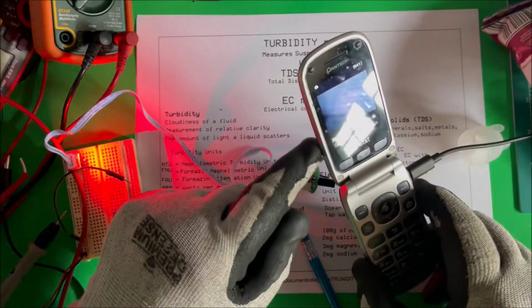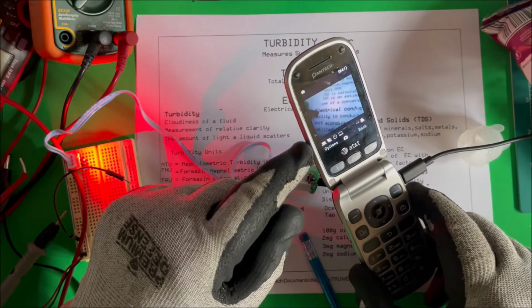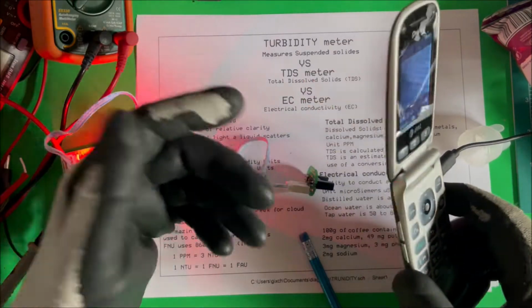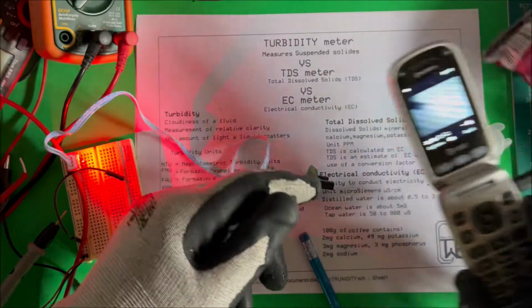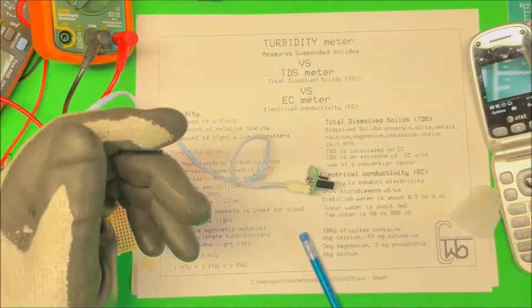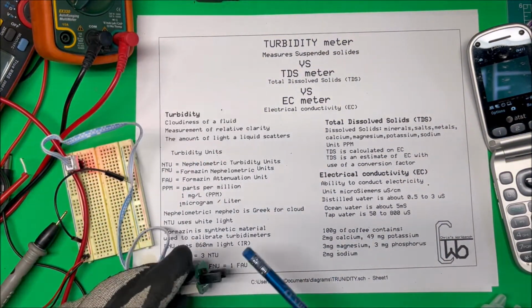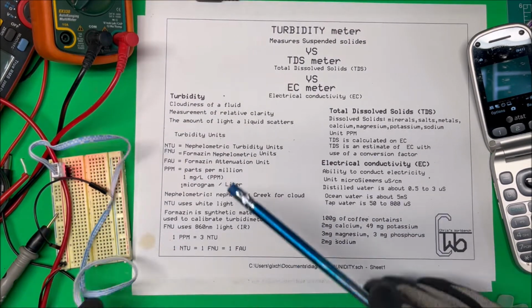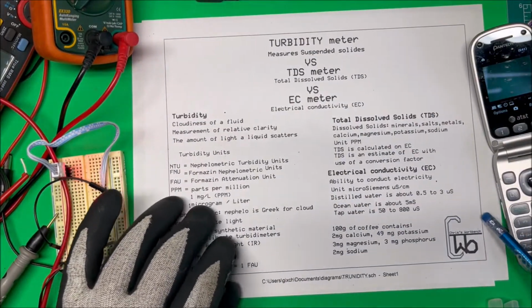Now, I'm using this old phone because the cameras in these don't have infrared filters on them. The new modern phones have filters, so you won't be able to see it. So, if you have an old phone, keep it so you can detect infrared. I'm going to turn the light back on. Watch your eyes. There we go. So, that's a turbidity meter. It just measures the amount of light that's scattered from one end to the other, and then you calibrate how much turbidity you have.